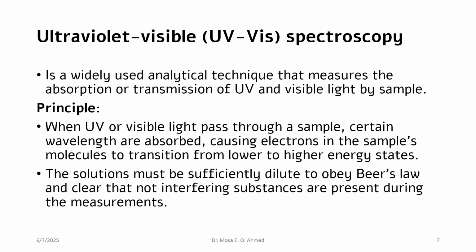The ultraviolet visible spectroscopy is a wide analytical technique used to measure the absorption or transmission of UV and visible light by a sample.